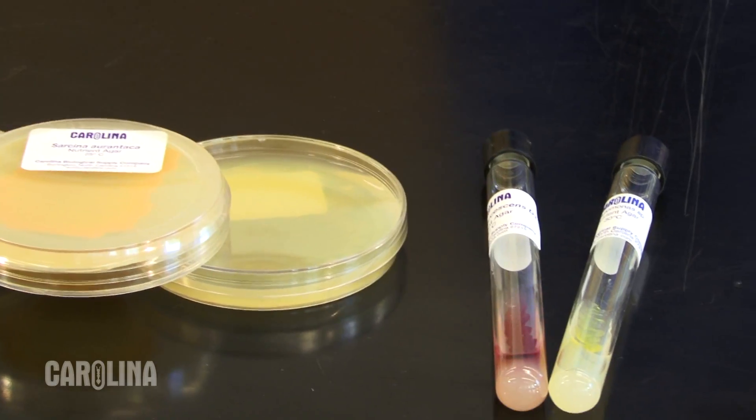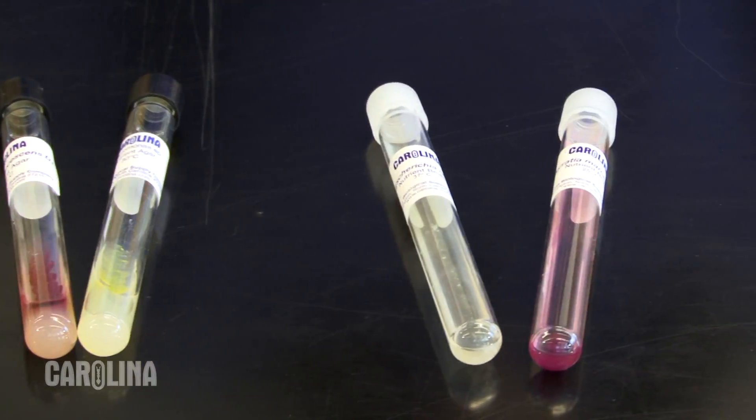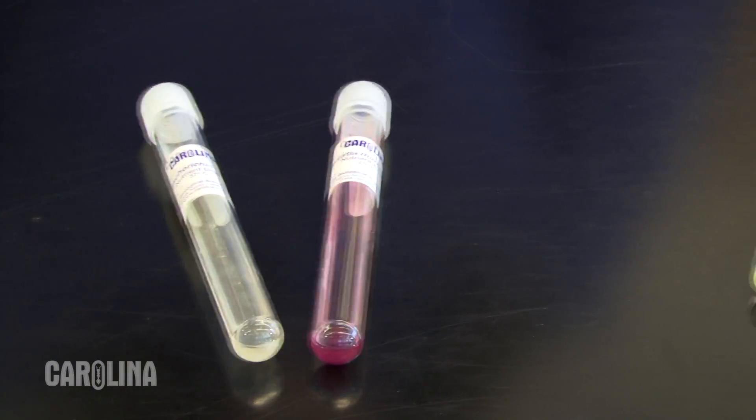Carolina offers a variety of bacteria cultures in several forms: on agar media, in broth, or freeze-dried, also called lyophilized.